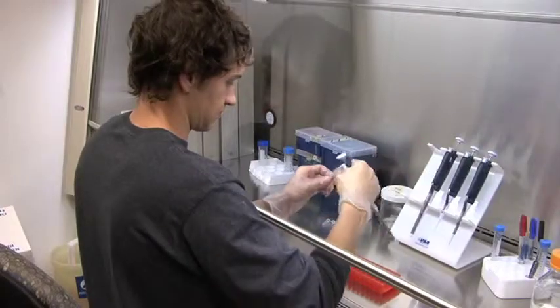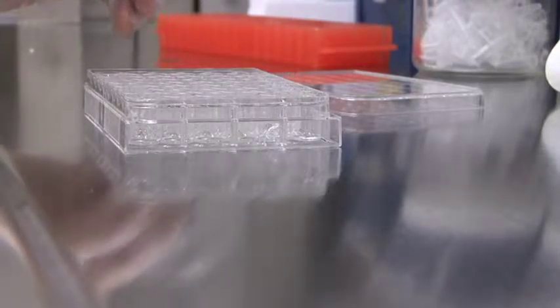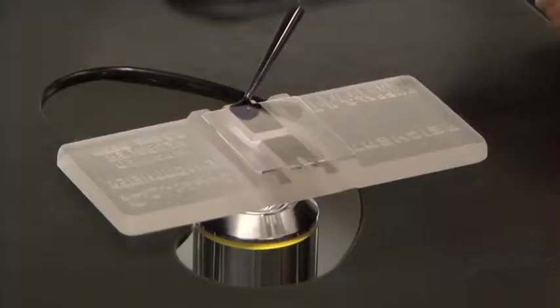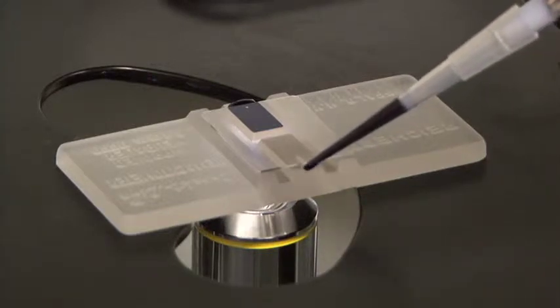A new 48-well plate is coated with the satellite cell's native substrate. This substrate is required for the cell's movement. A sample of the cells is analyzed using a hemocytometer to estimate the number of cells you have. A small grid is present, and the cells within the grid are counted.